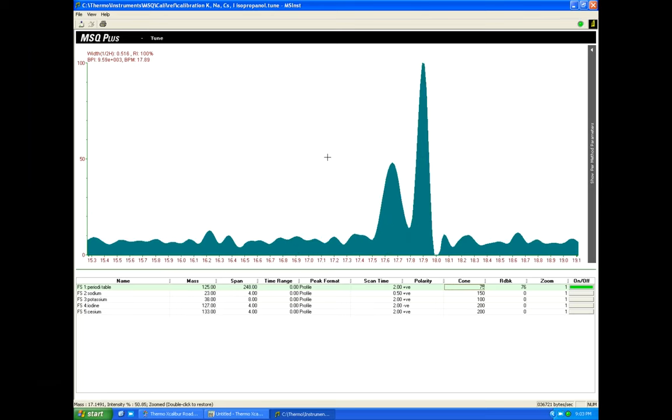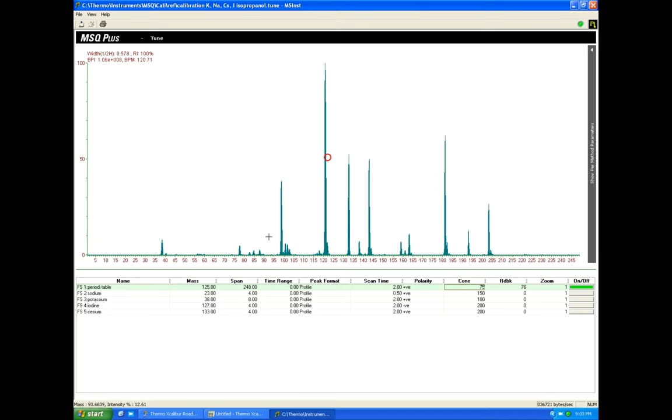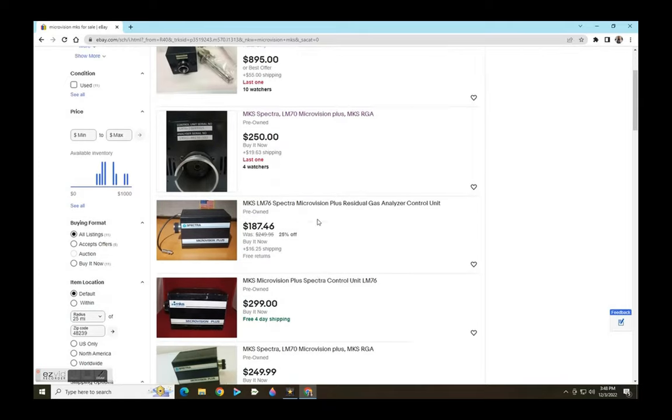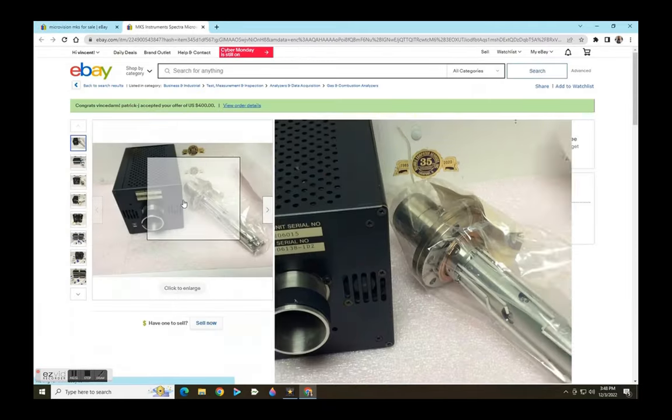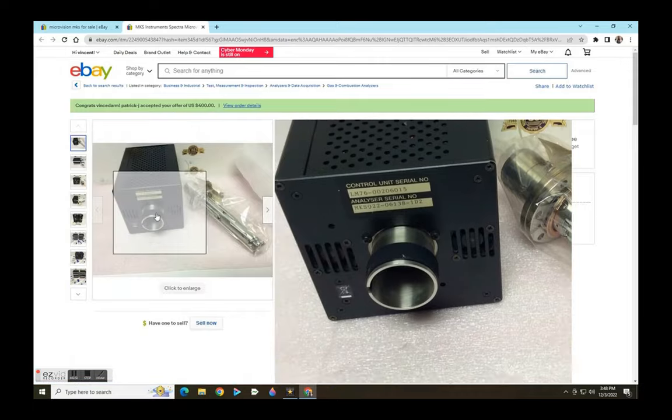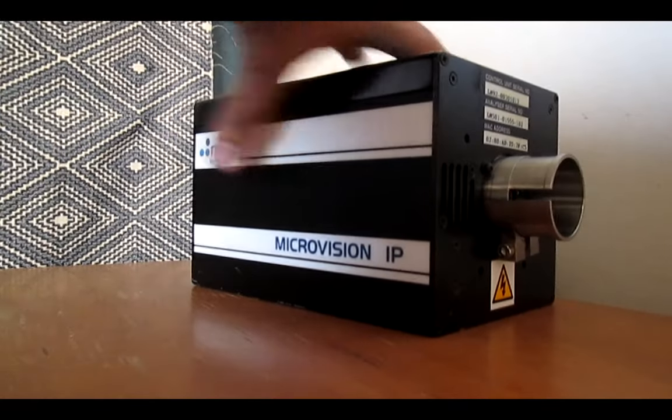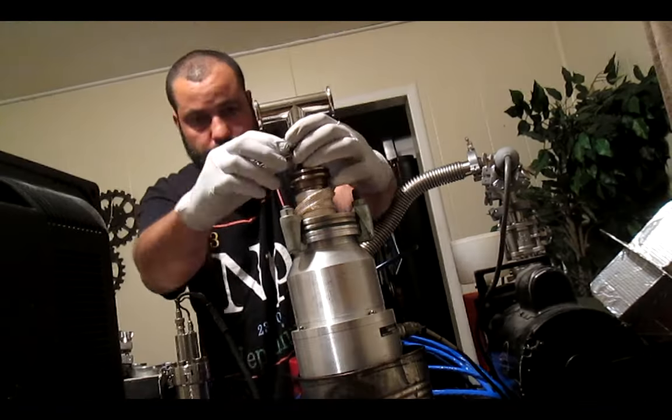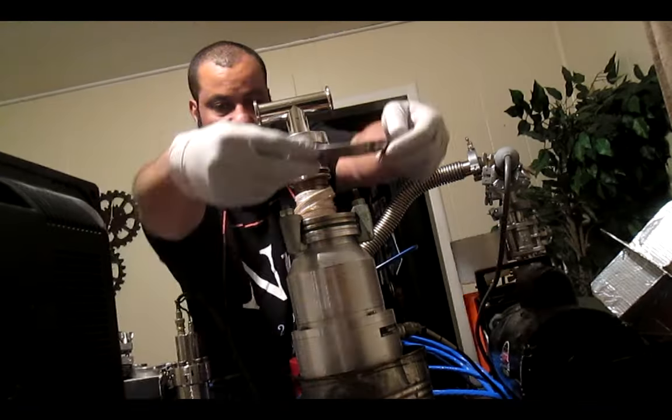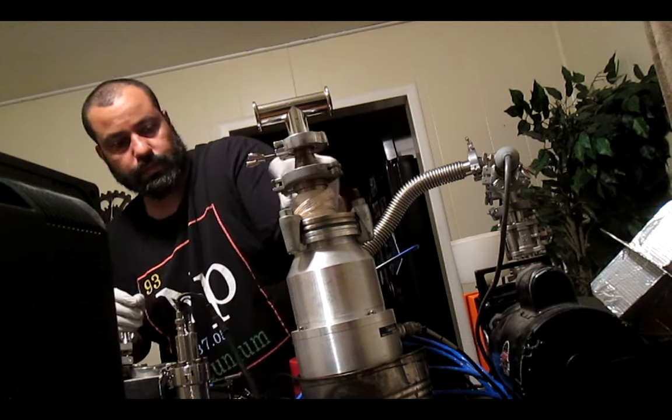So I found this residual gas analyzer on eBay. This is a device designed to analyze the contamination in ultra-high vacuum applications, demonstrated in the extreme laws of physics video back in December 2020.